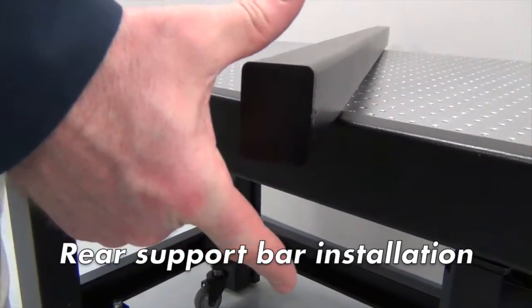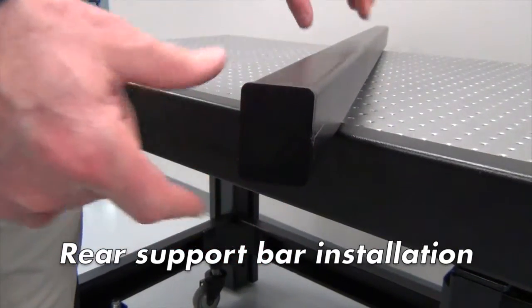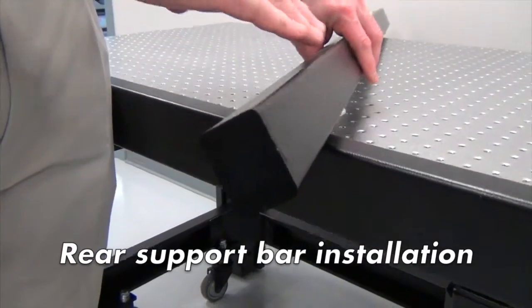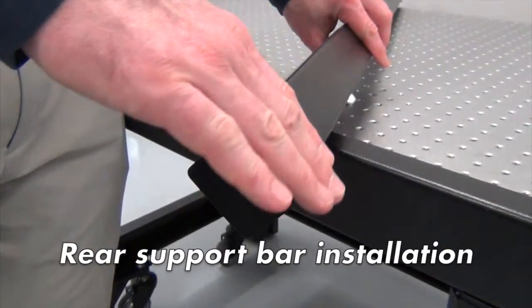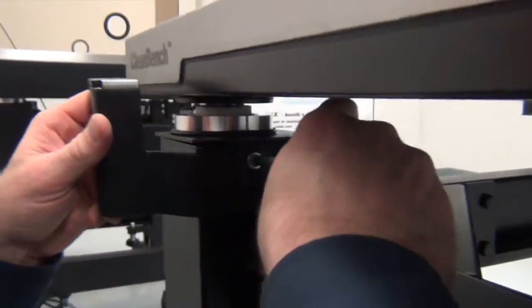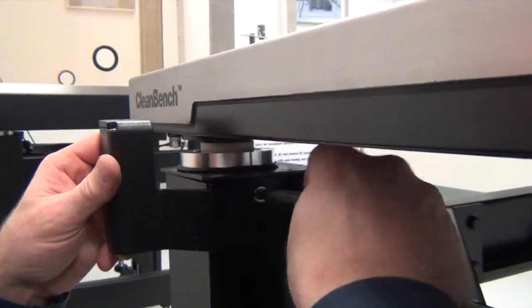The rear support bar is less tall and has a smaller cross section than the front. It does not have a slot on the back edge. The assembly of the rear bar is identical to the front support bar.